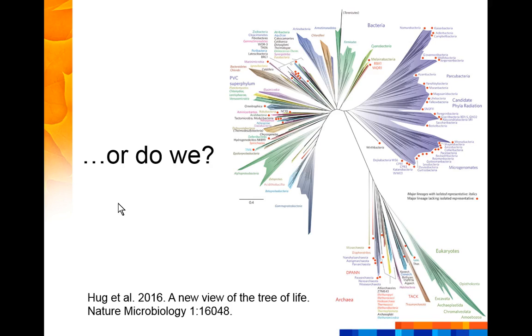But a counter argument to this is a publication from last year. Some of you may have heard about this candidate phyla radiation.